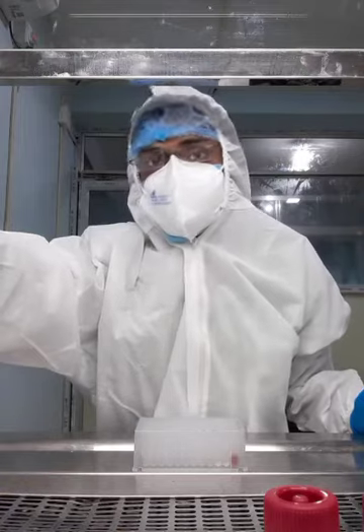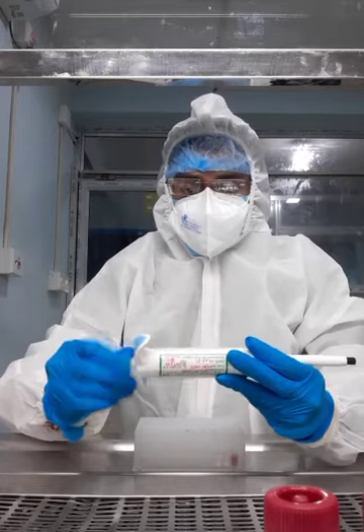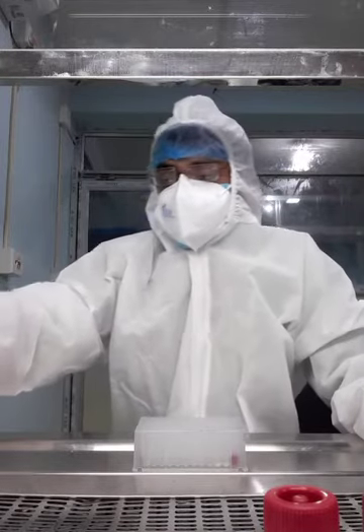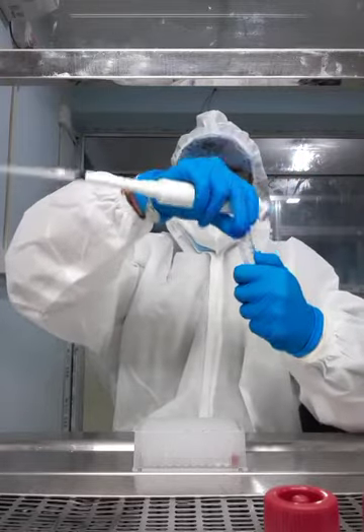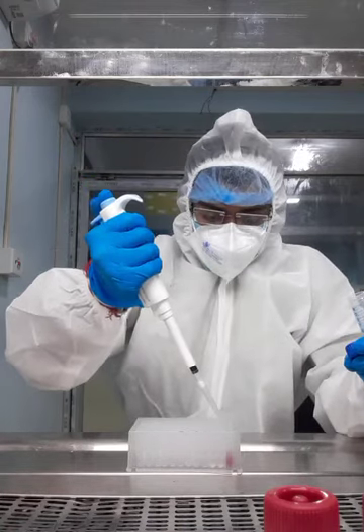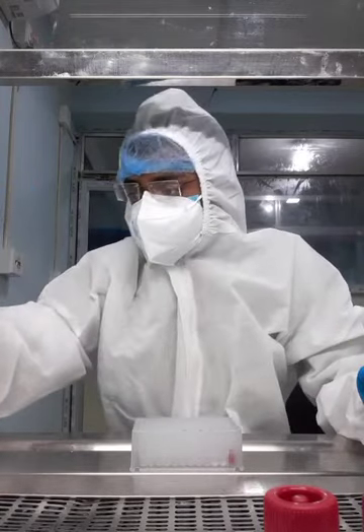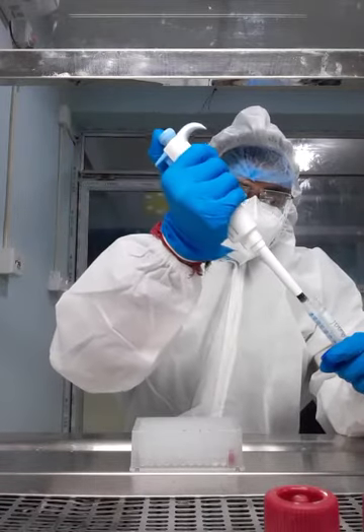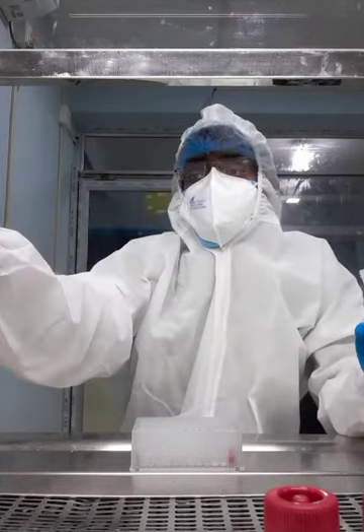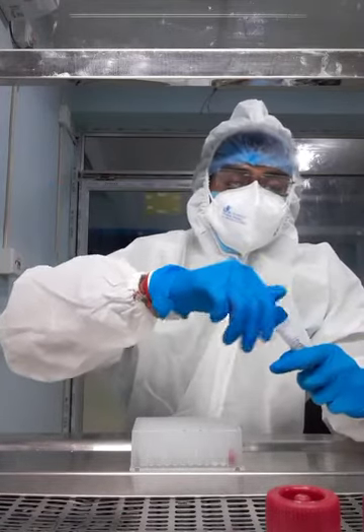Now it's time for putting 350 microliter 100% ethanol in the first column where you put the VTM sample and lysis buffer. So 350 microliter 100% ethanol we have to put in the first column of patient A. Then you have to dispose the tip, take a new tip and 350 microliter of 100% ethanol. Don't use that tip a second time.